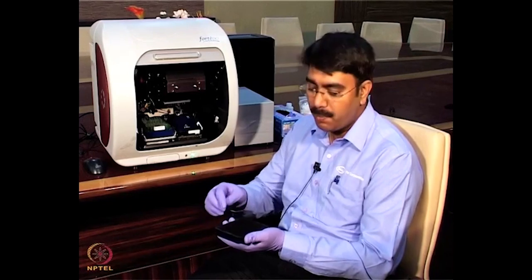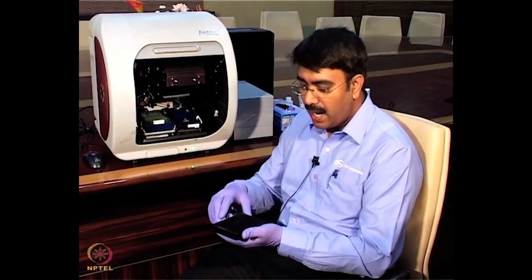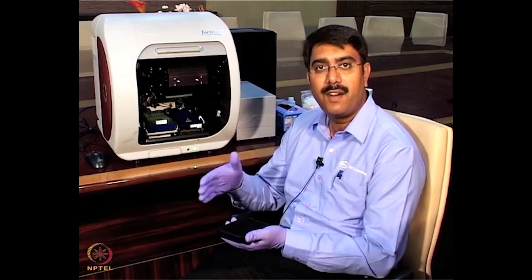I'm going to demonstrate the kinetics interaction of a mouse monoclonal antibody to a protein A ligand. Here I am using biotinylated protein A as a ligand, at a concentration of 10 micrograms per ml. I am putting it into 6 wells, and the mouse monoclonal antibody I am using as an analyte. I am taking the starting concentration at 25 micrograms per ml. I am going to do a 2-fold serial dilution from 25 to 12.5, and then serially 2-fold again, for around 6 data points.